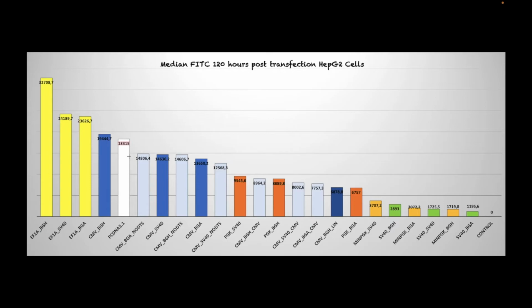Another thing that I can observe using this graph right here is look at how much the pcDNA expression decreased. So even if the pcDNA has enhanced GFP, as compared to my plasmids, which have a much weaker GFP, you can see how much this expression decreased. And I am pretty sure that this has something to do with the fact that I am using a SMAR region, which is a scaffold matrix attachment region, and pcDNA does not have one of those regions. So pcDNA is just a regular plasmid that they use for mammalian expression.